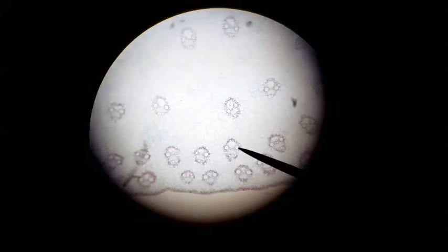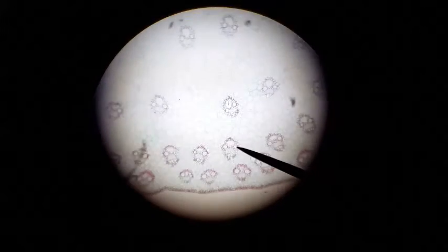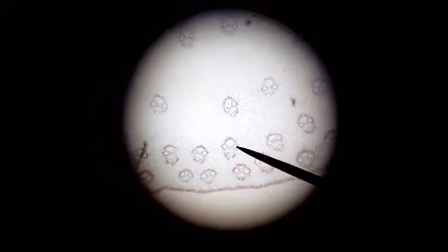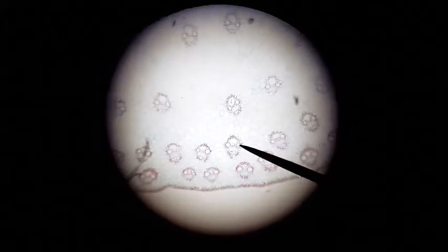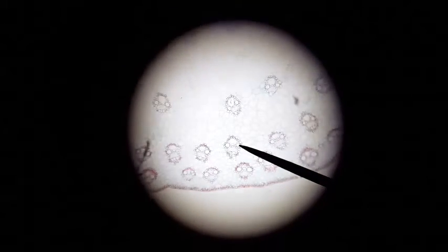Remember that the internal portion of the cell is parenchyma or pith, and sclerenchyma surrounds each individual island that we're looking at. The collenchyma is up next to the epidermis.